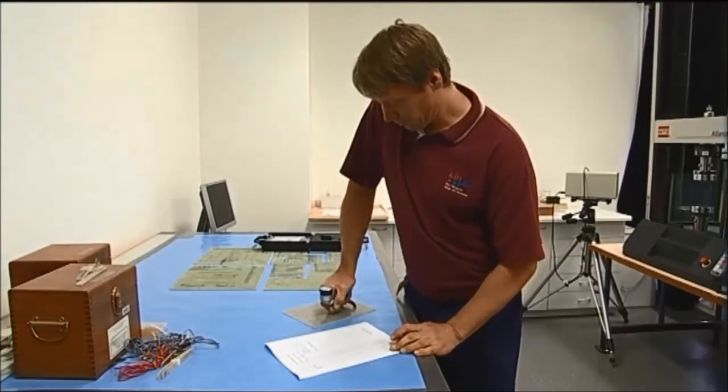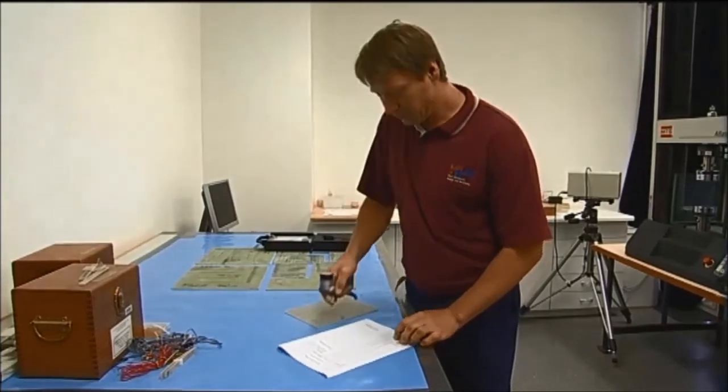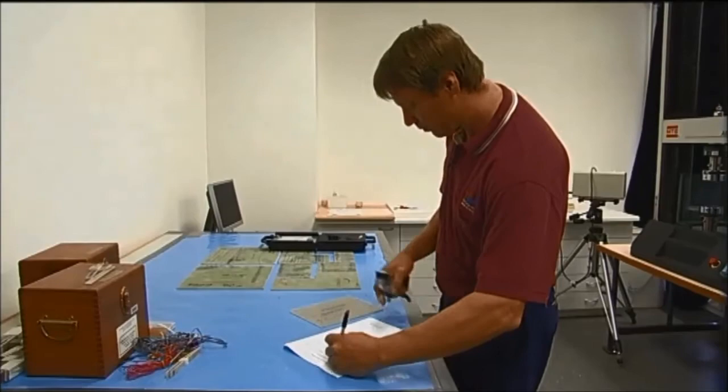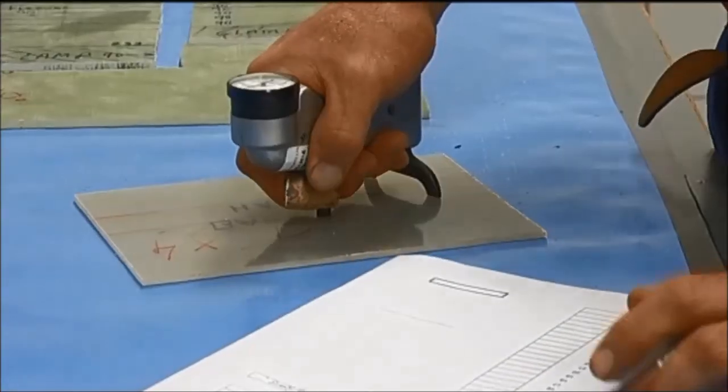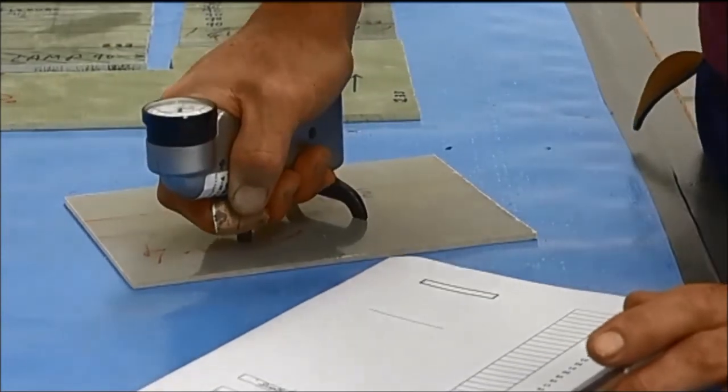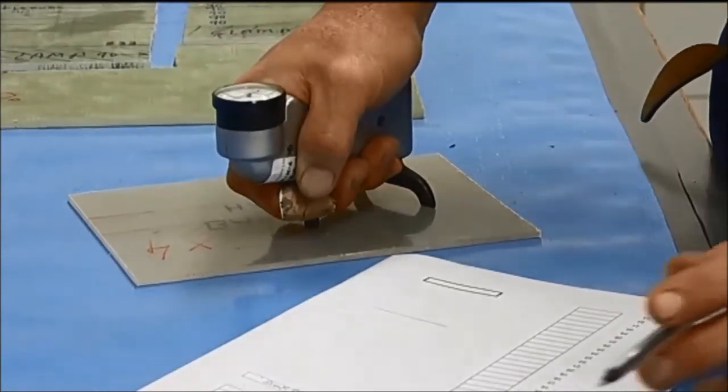The Barcol Hardness Test is used to determine the hardness of both reinforced and non-reinforced rigid plastics. This test characterizes the indentation hardness of materials through the depth of penetration of an indenter loaded on a material sample.